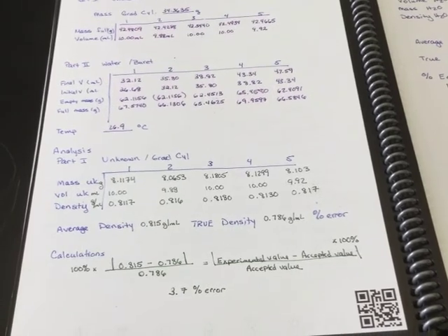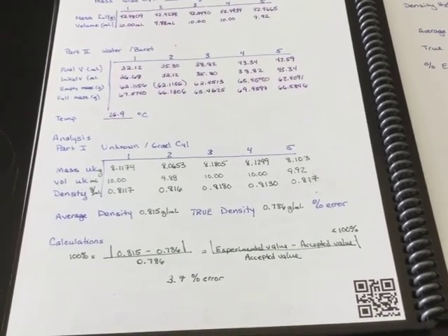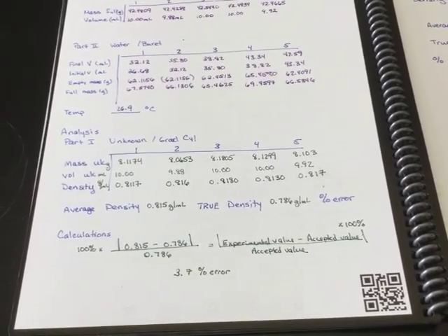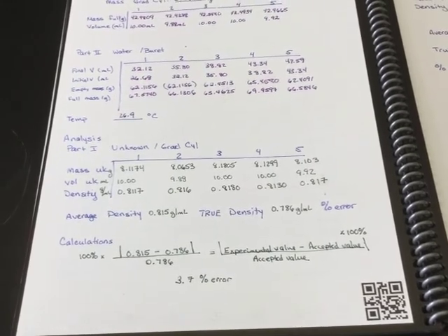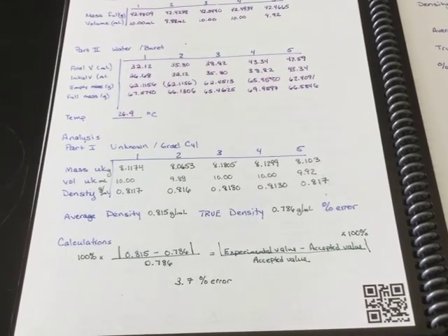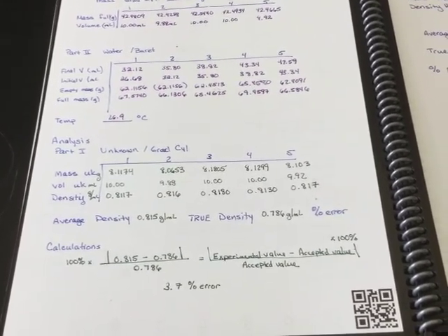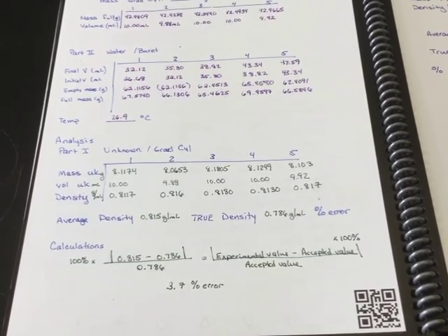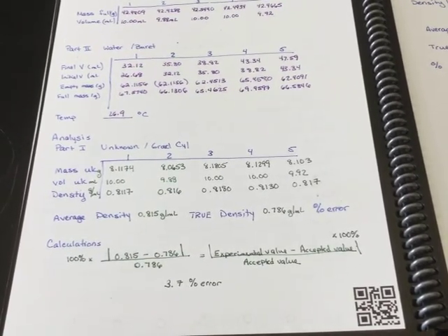Once you've collected all of your data, you can do your calculations and your analysis. You will need to find the mass and the volume for each trial. You will need to find the density. Remember that density is going to be the mass divided by the volume.